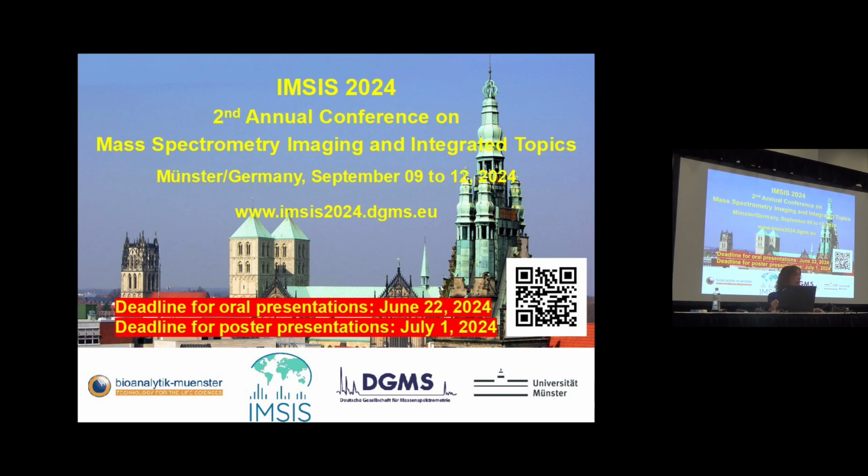So it was a 64-hour experiment to do it at 50 microns. And of course, in the way of ASMS, I'm collecting my data the day before I have to get the poster printed. So in that case I was a little bit limited, but certainly we can do higher resolution and we wouldn't need thicker tissue to do that. Sounds great. Excellent work. Thank you. Thanks.